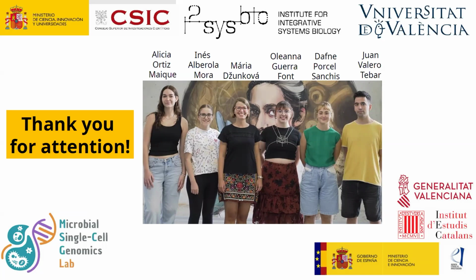Yes, it is on the 5' end, and this is something that you can choose. I use the IDT website to design my primers and to place my order. And there is a way you can just choose some fluorescent label.